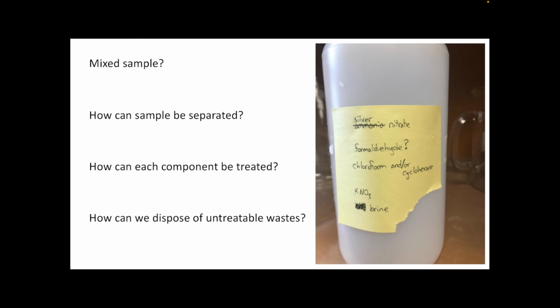And the final thing you should be thinking about is if there are chemicals that we either can't find a treatment method for, or that we know cannot be treated in the facilities that we have available, how do we dispose of those untreated wastes?